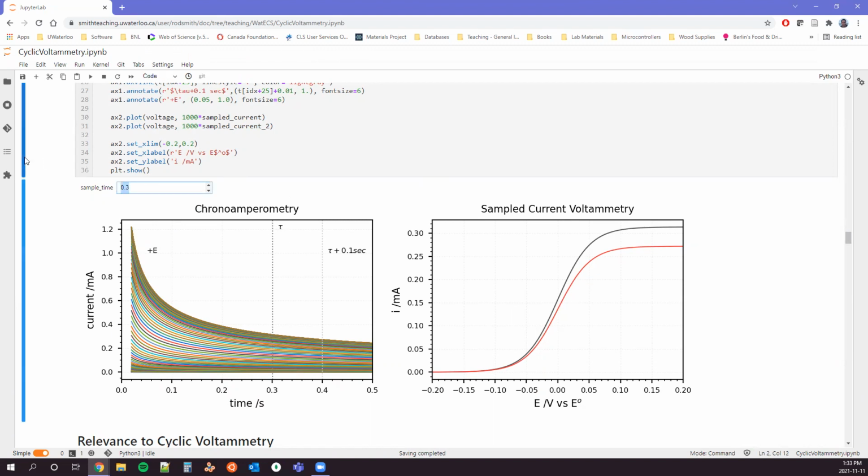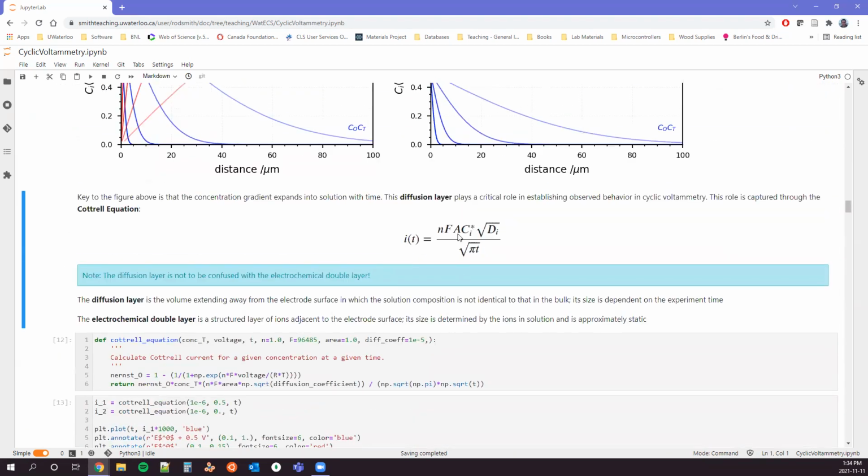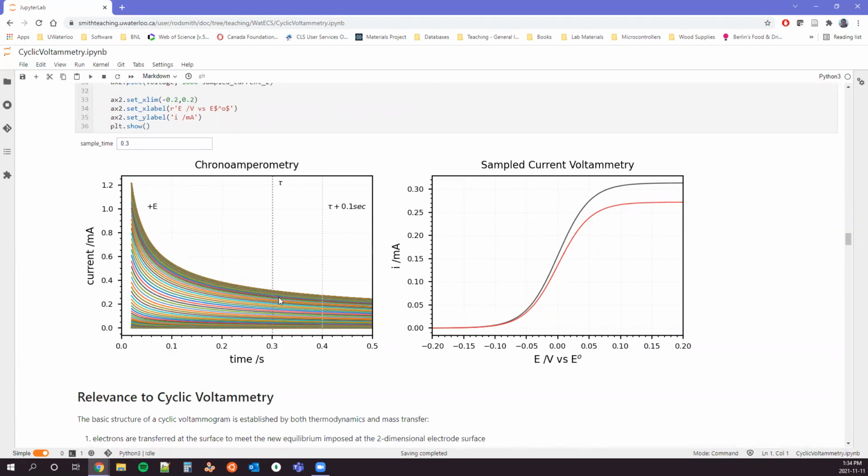If we want to do sampled current voltammetry, all that we're going to do is define some special time. Here I've got it at 0.3 seconds. All that we would do is take this cut. We take the current at that given time, and then we can plot it as a function of potential. What we see is basically that thermodynamic Nernst equation again, right? At a given time, because we have this fundamental relationship that is based on time and diffusion, all of these are the same in these series of experiments. And so we can take this current as a function of time and voltage and recast it into our thermodynamic plot.